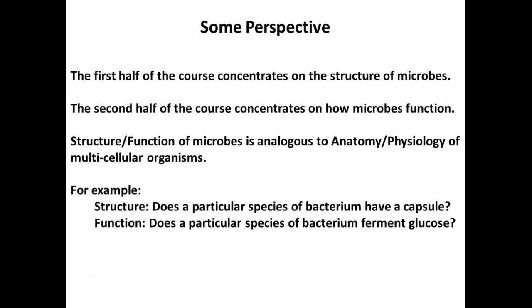For multicellular organisms. So again, does an organism have a capsule? That's a structural component. Of course, it does have some functionality to it. A big question that we ask a lot, especially today as we were doing these tests and looking at our results from the different media that you've employed, is fermentation, right? Can they ferment different sugars? Glucose is one of the sugars that we look at.